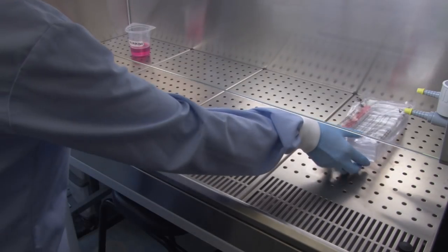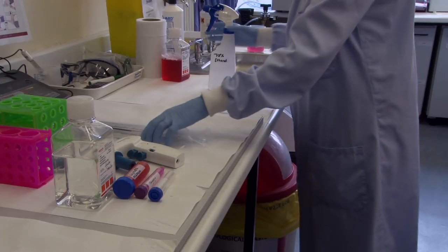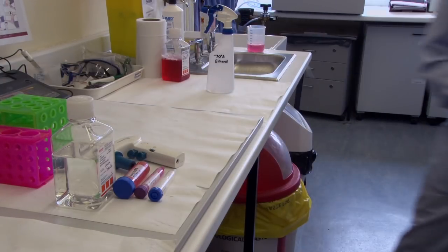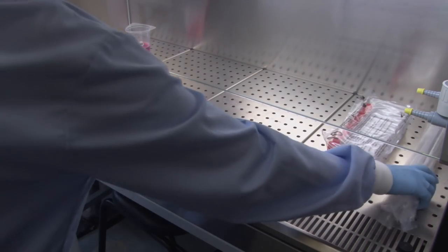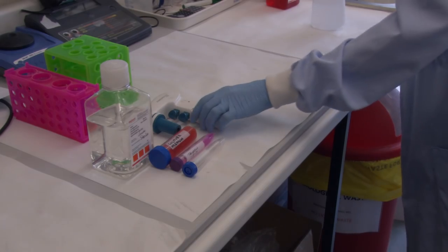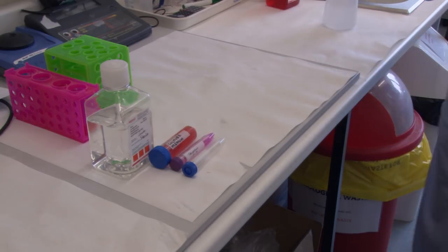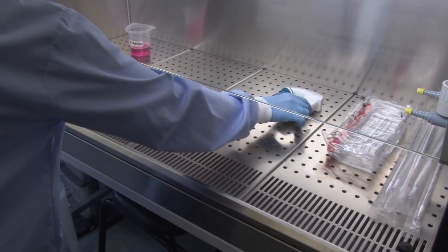Sterilizing all of the equipment using ethanol prior to placing it in the cabinet is one of the key ways of preventing contamination. Arrange your equipment in the cabinet, to the right if you're right-handed. Don't bring too many items into the cabinet as this can disrupt the air flow.